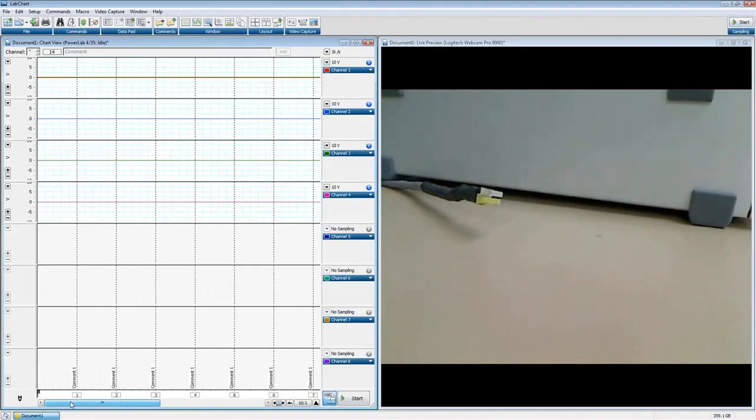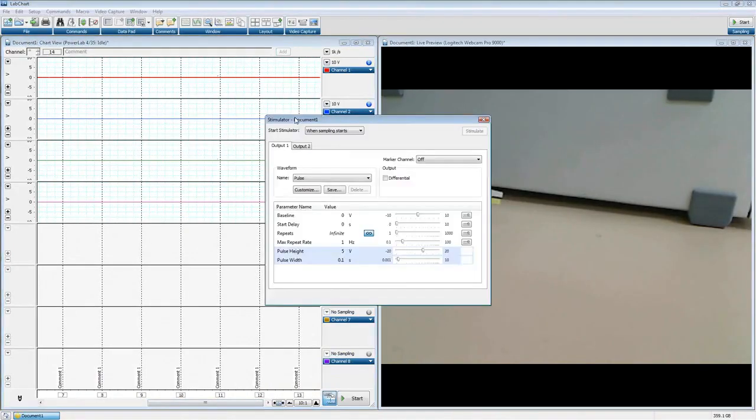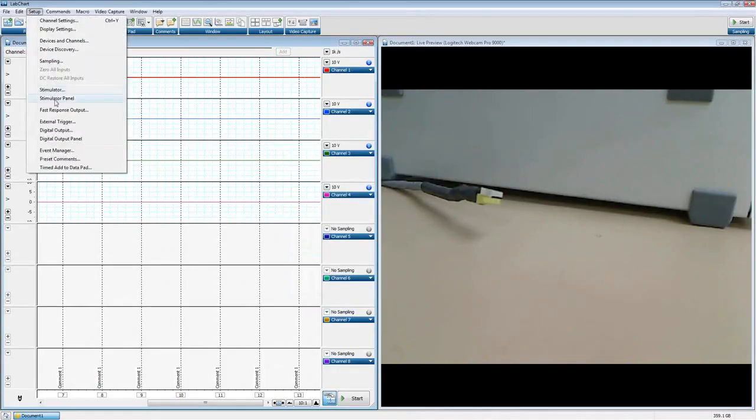And you can see here, all the comments are occurring. We have a slight little bit of software lag, very, very small, 1 millisecond, exactly at 1 hertz. So they're responding to that signal coming in. If you don't believe me, say, oh, that's automated, here's what I'll do. I'll set up the stimulator. I'll set it to trigger manually. I'll open the stimulator settings, stimulator panel.